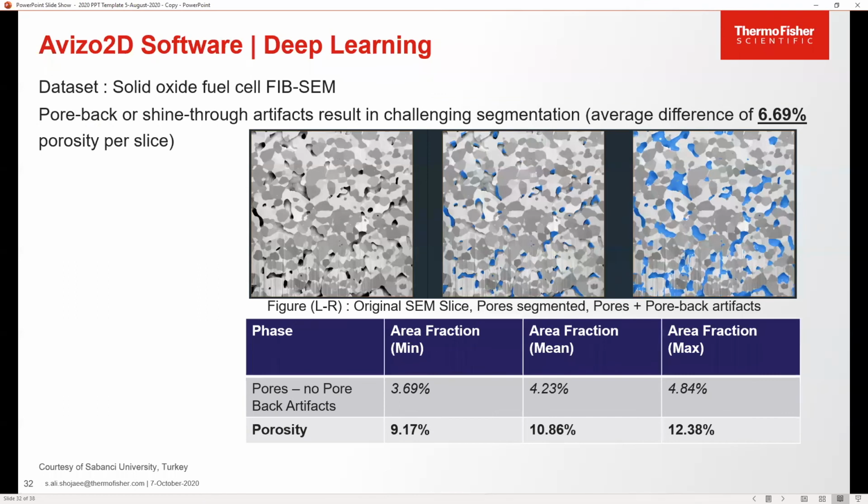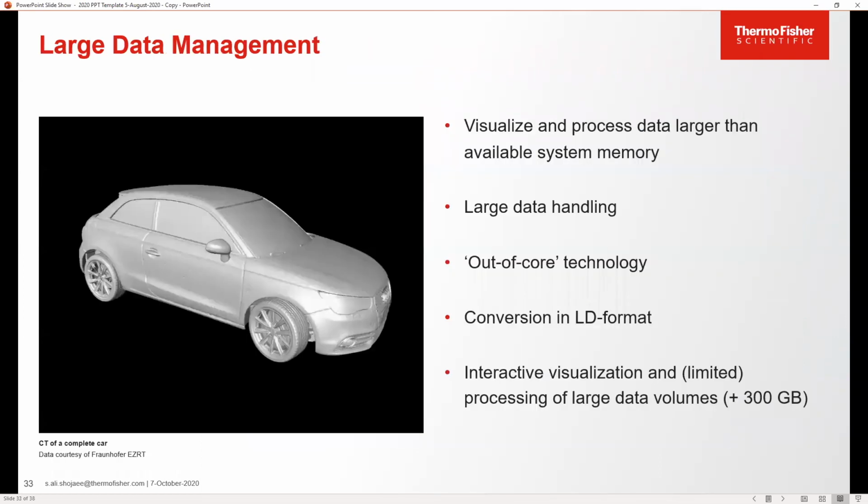I have done it on a few slices, and that has been used for both validating and verifying the results. Once this model is available, every other time that I have an image that looks like this, the solution has been generated by the software. You don't have to do it every time. This is also available in Avizo and Amira for any super challenging images that you have.